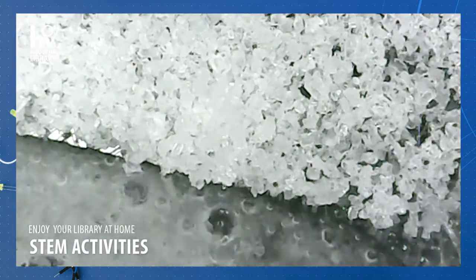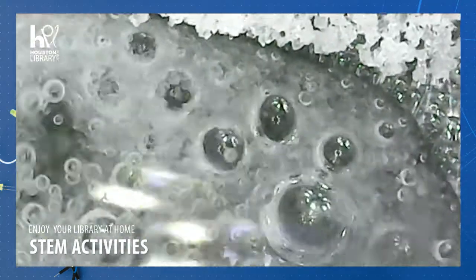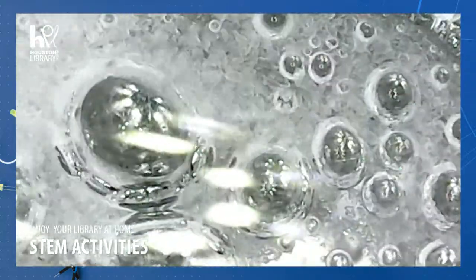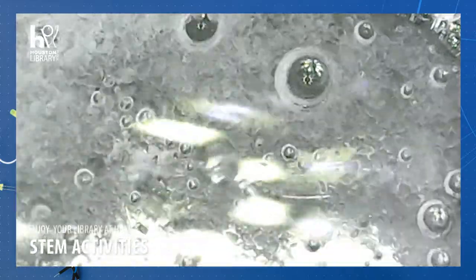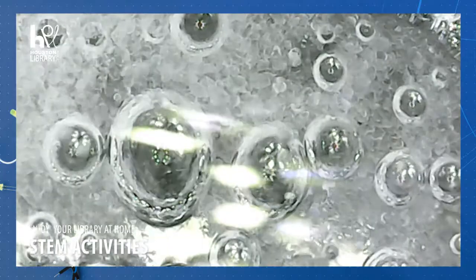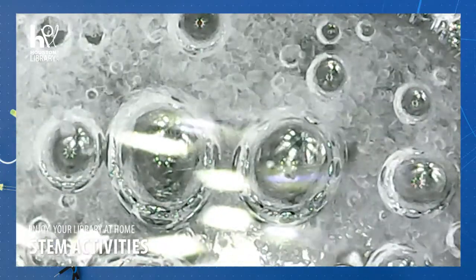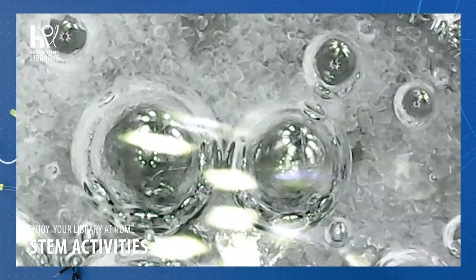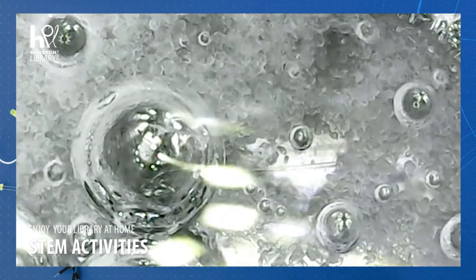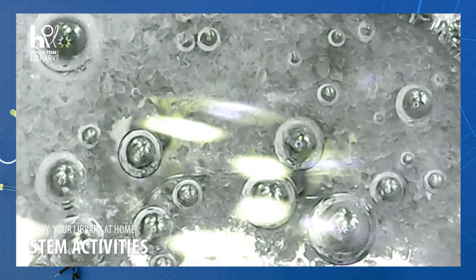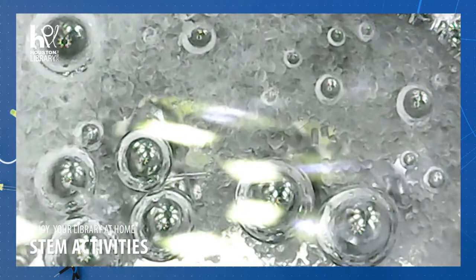So what you're seeing here is a chemical reaction between both ingredients. So the reason why they react is because baking soda is a base and vinegar is an acid. So the hydrogen ions in vinegar react with sodium and bicarbonate ions in the baking soda. And the result is two new chemicals which are carbonic acid and sodium acetate.